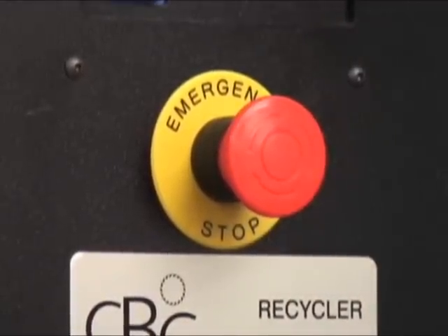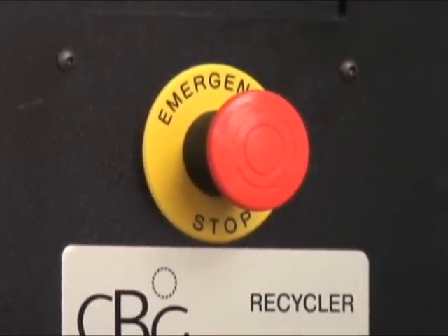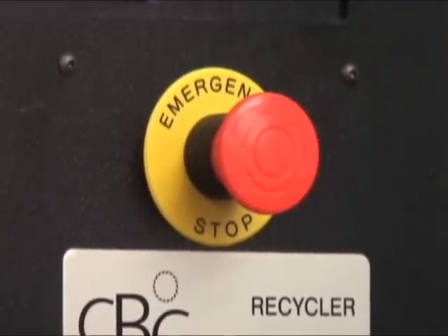If at any time you want to shut this machine down, all you have to do is press it and the machine is off. To reactivate it, don't pull it — just turn in the direction of the arrows and it pops back out. It does not lose program because it loses power. Very nice system.